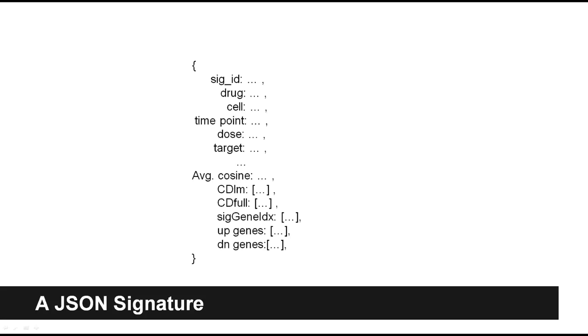There are several different values, but I think there are maybe four different names for control. In some of the experiments the label is DMSO, for some experiments the value is control vehicle, and in other experiments it's something else. But you can easily identify which replicates are controls by using this pert type field. Thanks.